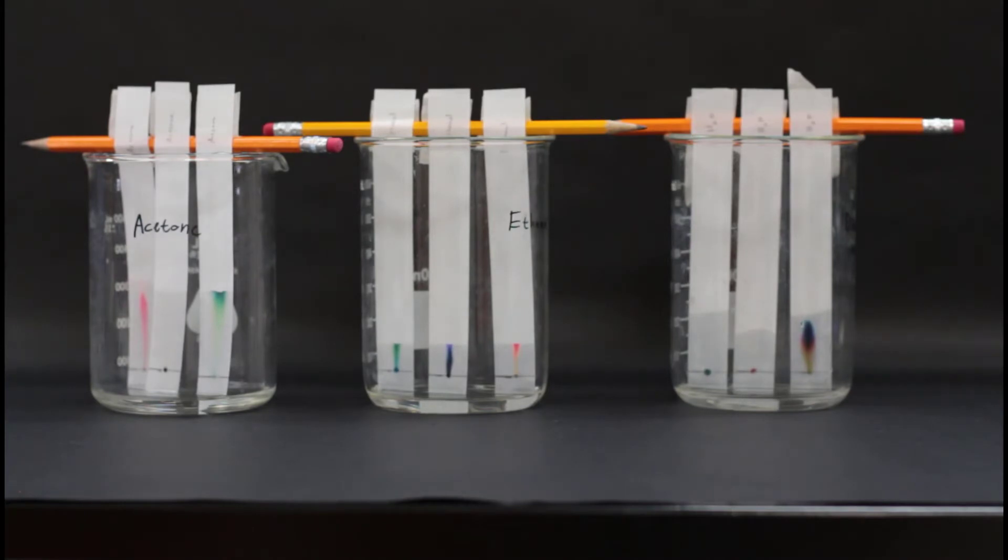For the discussion section, you'll create a table and determine the RF value of each pigment for each solvent. That's how far that substance travels with the solvent. Then you'll identify the polarity of each solvent that we use. We'll be using three of them. I'll show you how to determine the RF value at the end of this video.